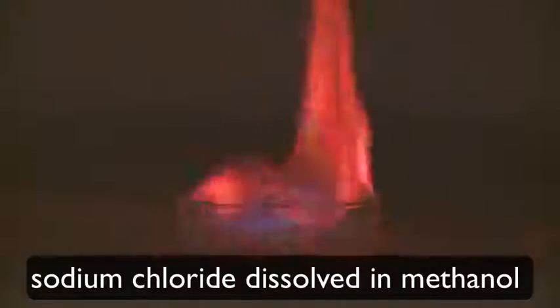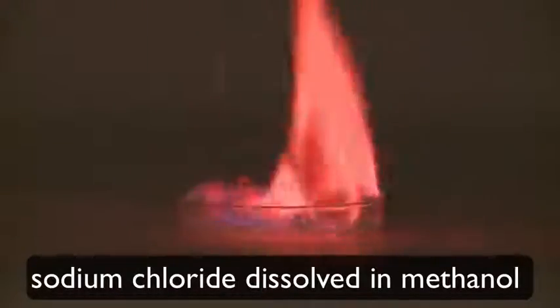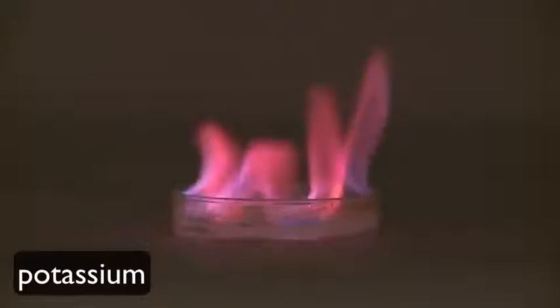Since you have plenty of sodium chloride at home, you can check this one out live, but make sure you have a controlled environment for containing the flame. Next, let's look at potassium. This potassium solution in methanol burns lavender.